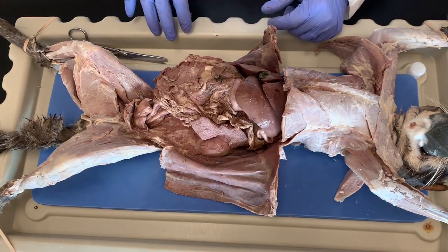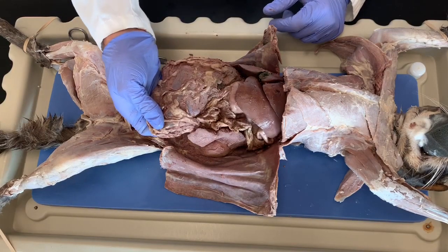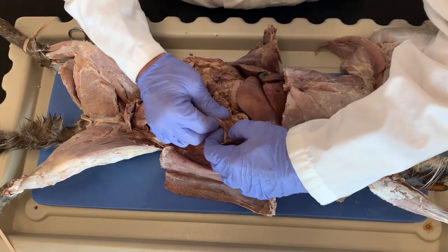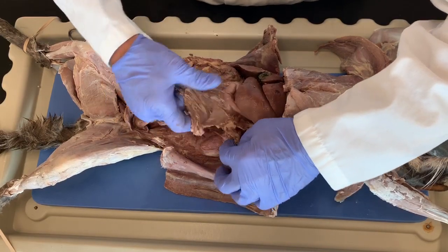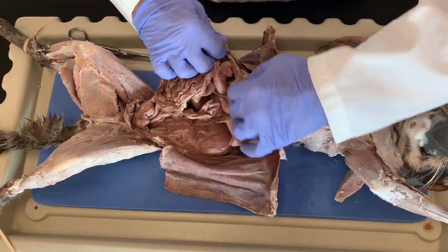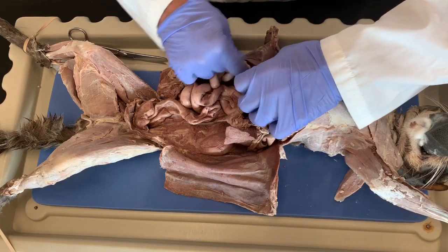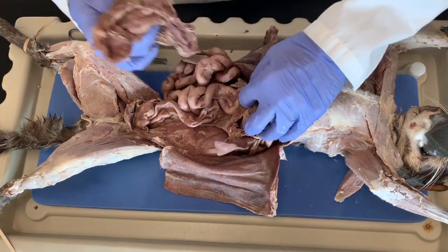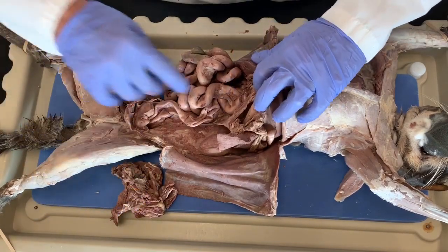So the first thing you want to do is kind of disconnect this omentum and set it aside. So it breaks free fairly easy. So we're going to just tear it away and kind of set it to the side. Okay, set that to the side.